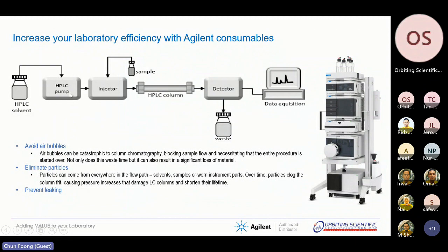And the next thing is leaking. We can see that the LC system is what we call a modular system, which means that we have a pump, we have the injection port, and we have the LC column with the detector. All these are connected via tubings. Because of the high pressure on the column, we need a high pressure pump, and this high pressure requires a very good connection, especially at the column. Otherwise, it will cause leaking. So leaking is another thing that we need to watch out for during our LC analysis.